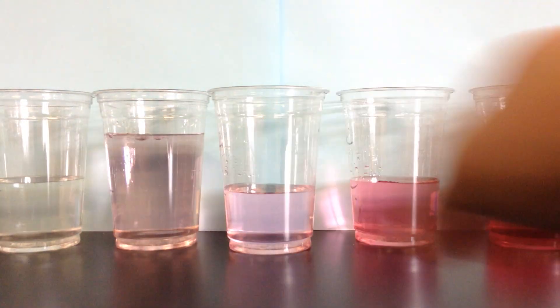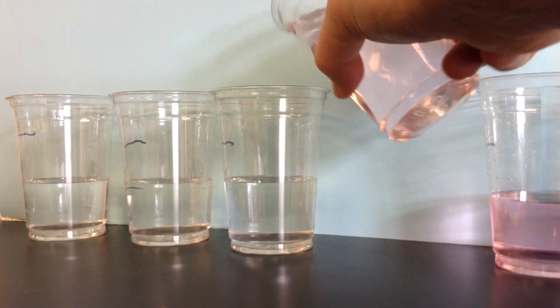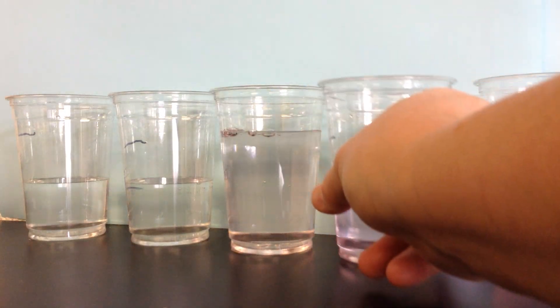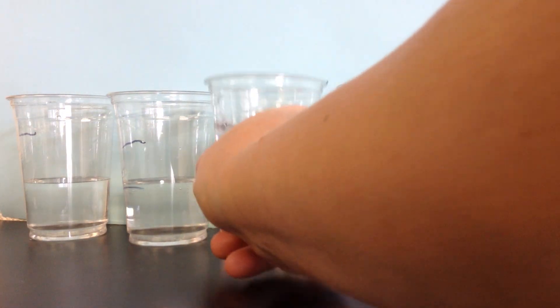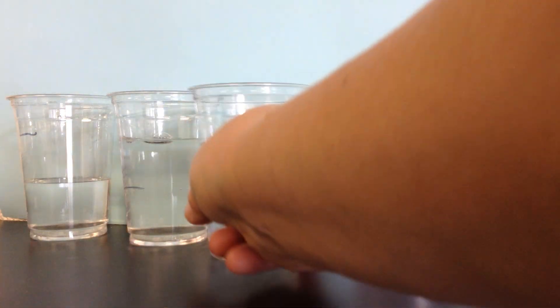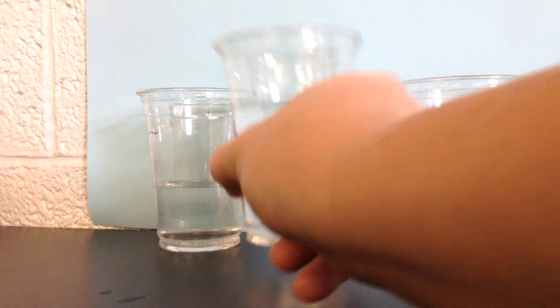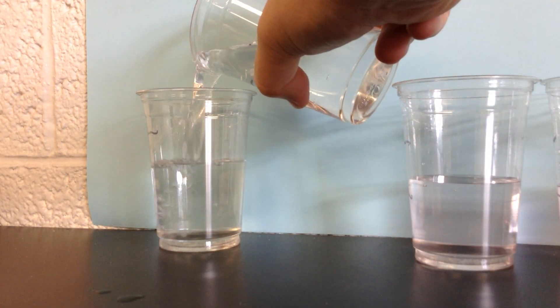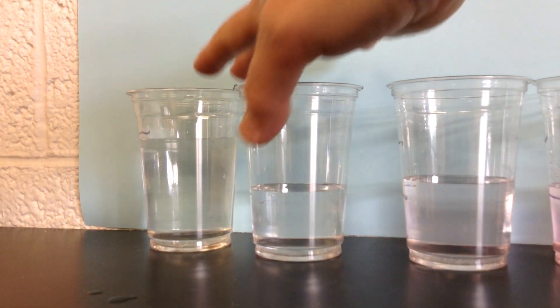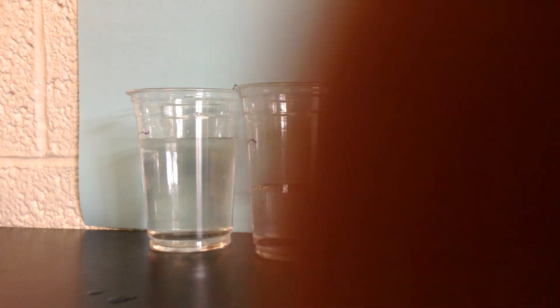And down the line we go. We're getting really, really pale on the pink here — you can hardly see it at all. Until we get to here, and here we have the most dilute solution. There's very little of our solute in here; we can't even see the pink color.